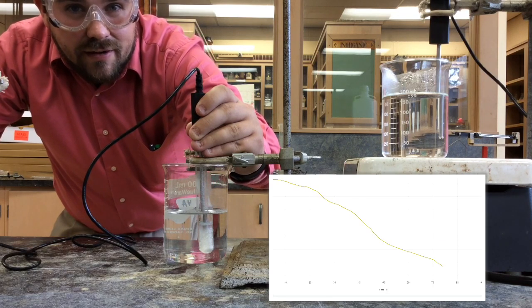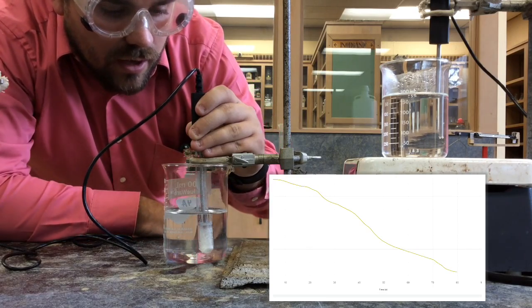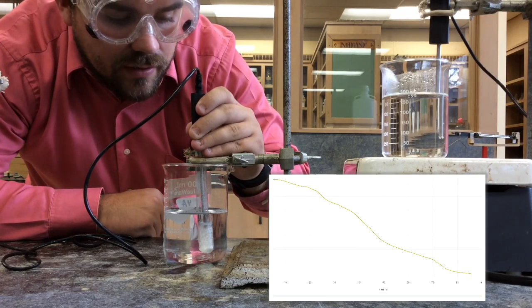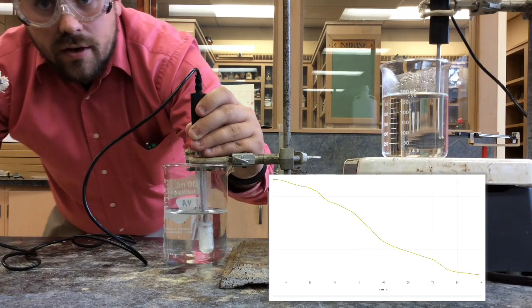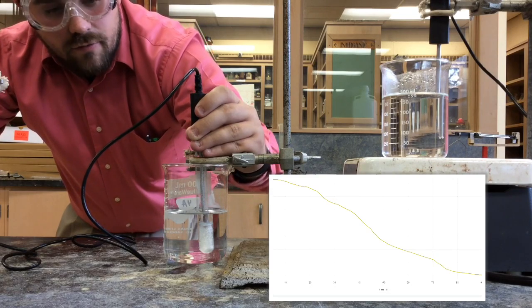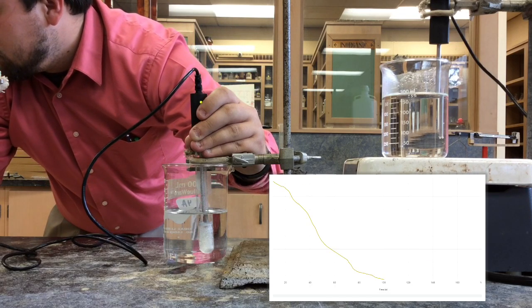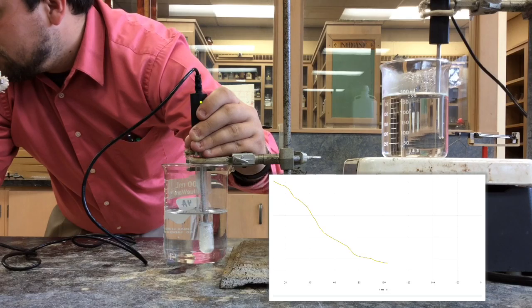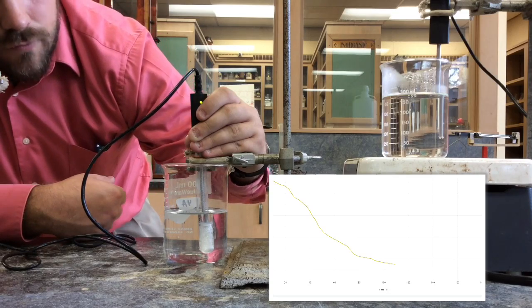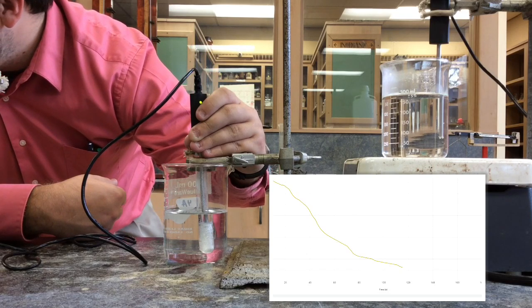And eventually it's going to be completely solidified. It's just a matter of making the transition from a liquid to a solid. And once it's completely solidified, I won't be able to remove my Go Temp very easily. It's going to take some yanking if I wanted to get it out as a solid. However, I'm probably just going to warm it back up to get it out. And so now it's just a matter of waiting. I will say this, the freezing point of the lauric acid is about 43 to 45 degrees Celsius. Now we're getting close to that. It's about 47 right now.